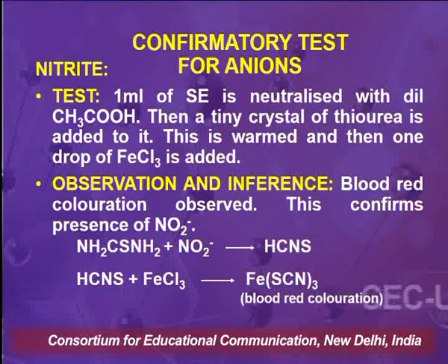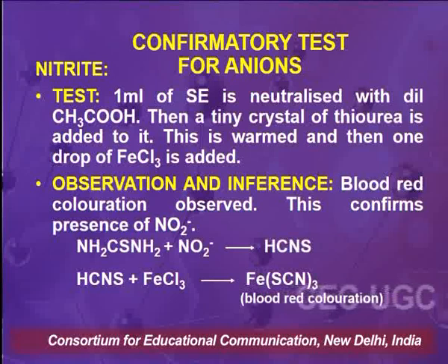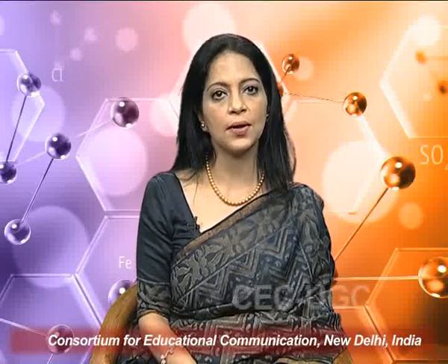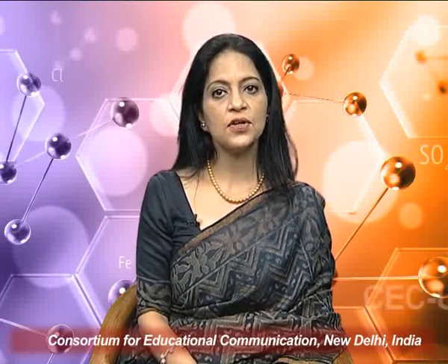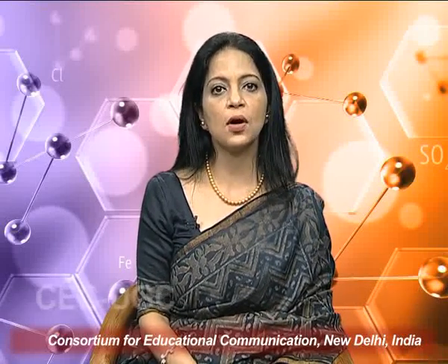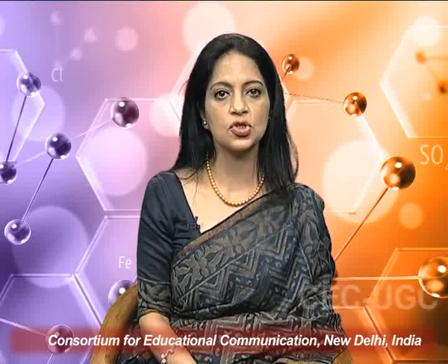So HCl or sulfuric acid here cannot be used as a neutralizing acid for soda extract. Only dilute acetic acid has to be used. This is then warmed, and then 1 drop of ferric chloride solution is added to it. In the observation, if a blood red coloration is observed, this confirms the presence of nitrite ions in the mixture.